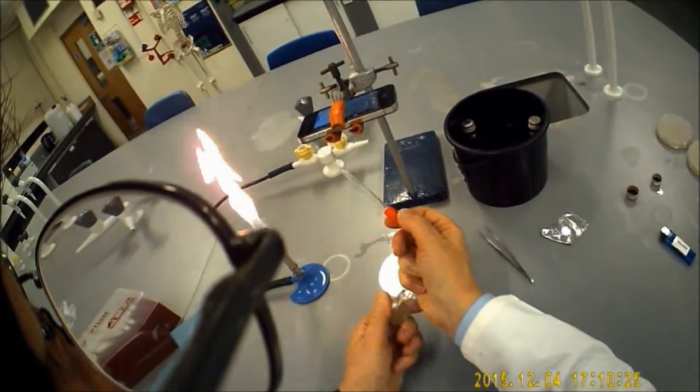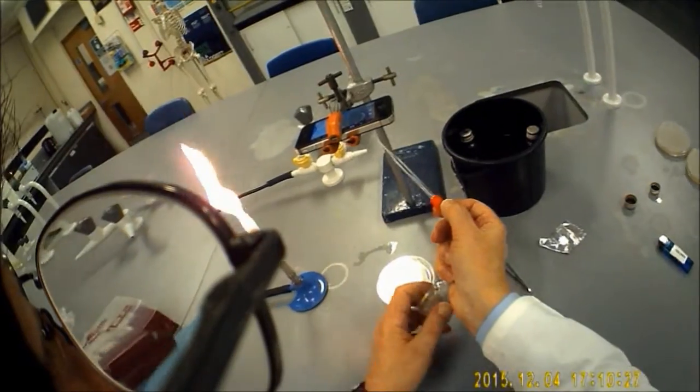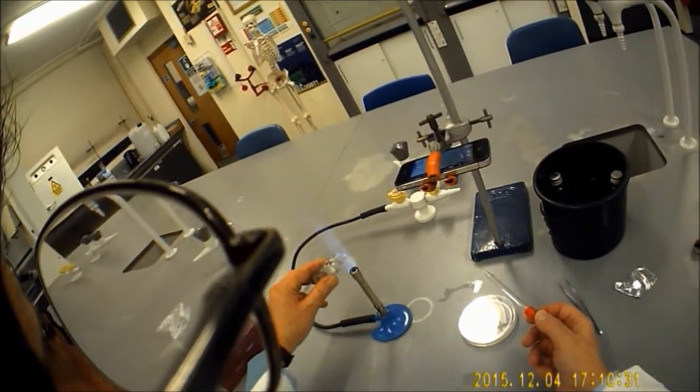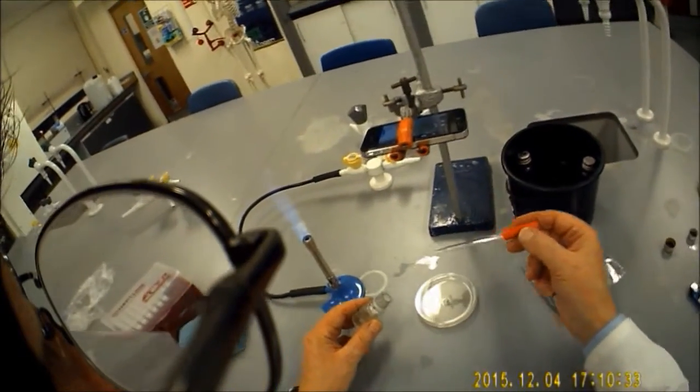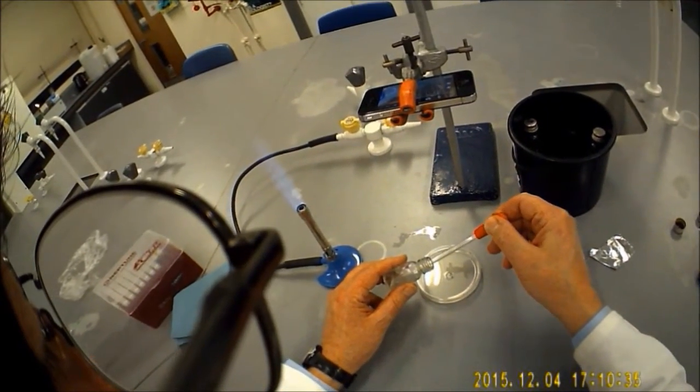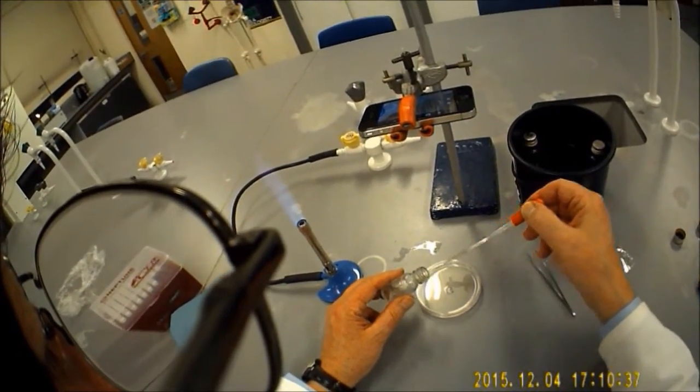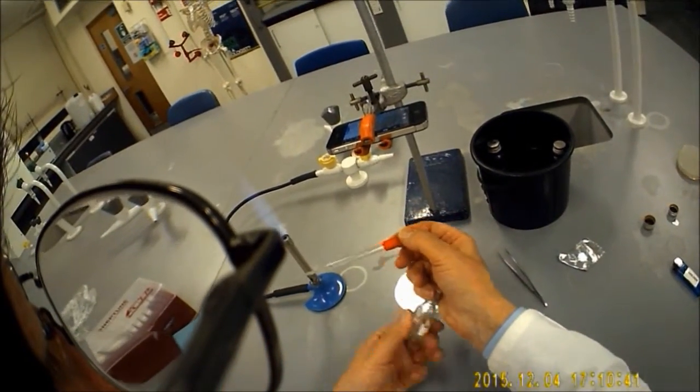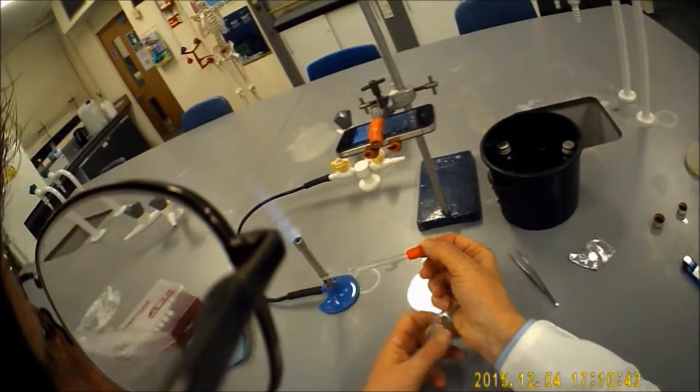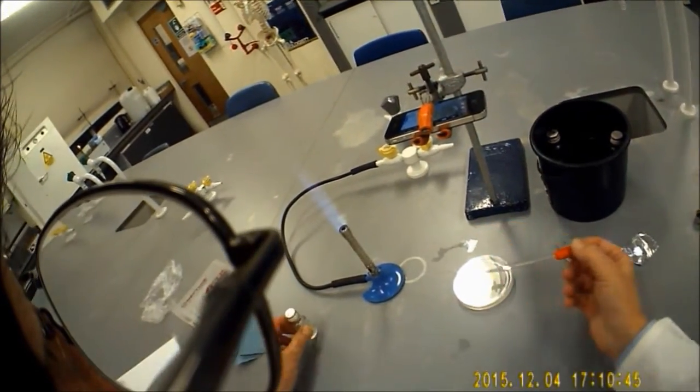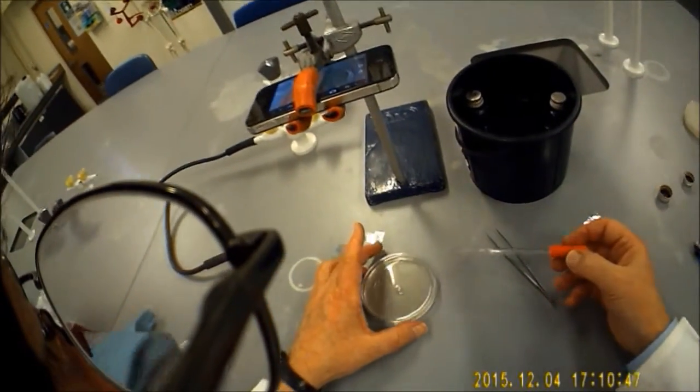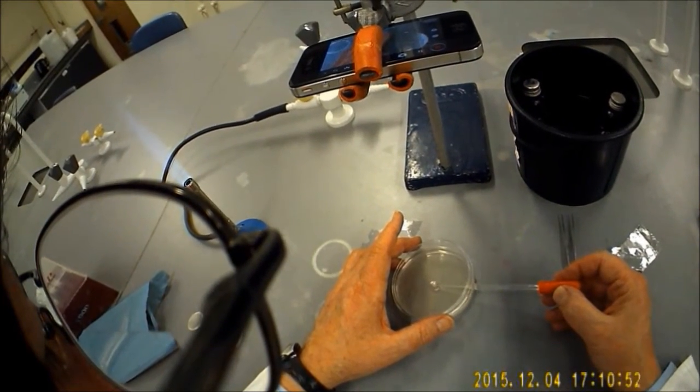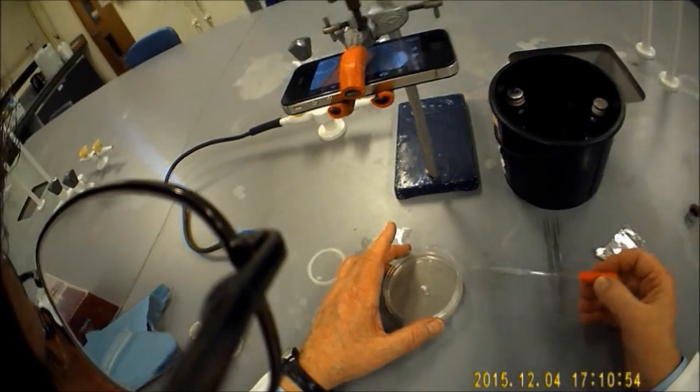So again, aseptic conditions. I'm going to sterilize the mouth of my bottle. This is a sterile pipette. You don't actually need very much to fill the well because don't forget you've put a little bit of agar in the bottom of it. So we're just going to reach underneath and pop some into the well there.